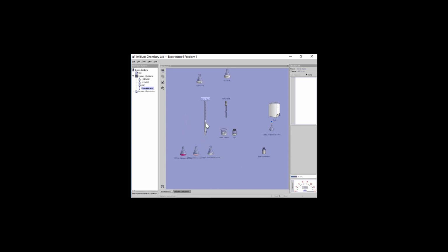If at one point I didn't have enough, I would refill it first. I'd take a new starting reading. Maybe I'll demonstrate that for you here. In my burette so far, it's 31. I actually know I have enough, but just in case you were worried I didn't have enough, what you can do is you can pour in more NaOH. It's just you don't want to refill mid-titration.